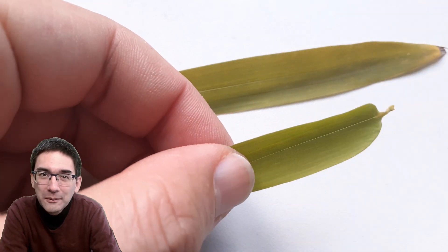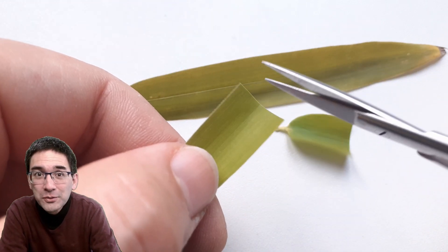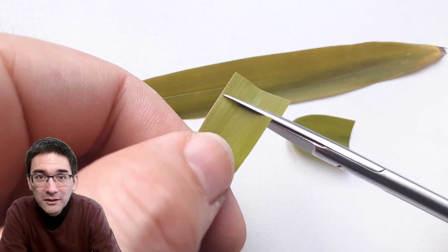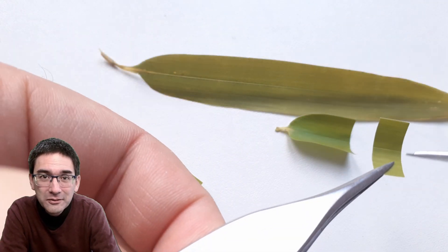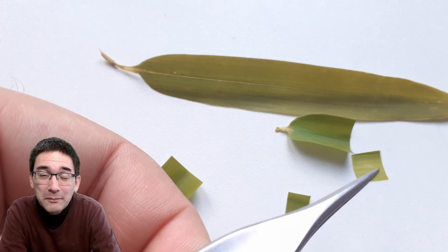I put the bamboo leaf into a cup of water to keep it a little bit fresh — that's actually quite important — and then I simply cut out a little square and tried to observe it directly under the microscope in the hope that I'd be able to see something.